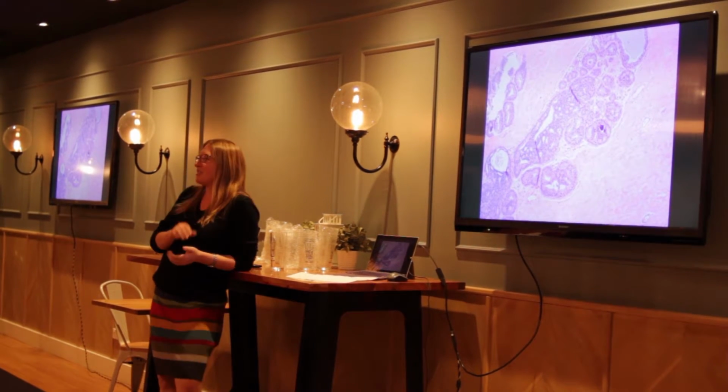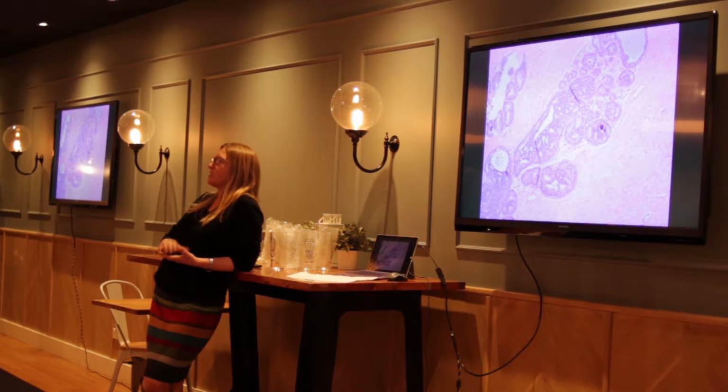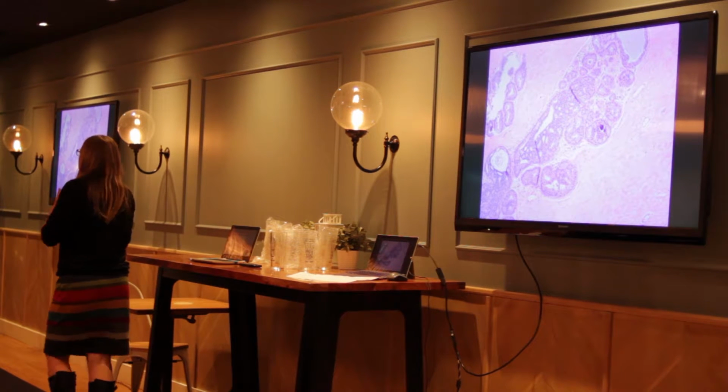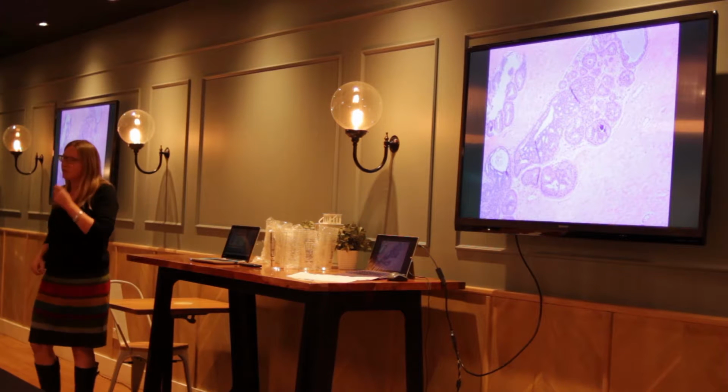So what sort of images do these microscopes take? Okay, that's histology. It's a standard H&E. If you get a biopsy, it gets sent away, and people screen these for different drugs, and then people have a look and they test whether their drugs are useful against this or this specific drug.